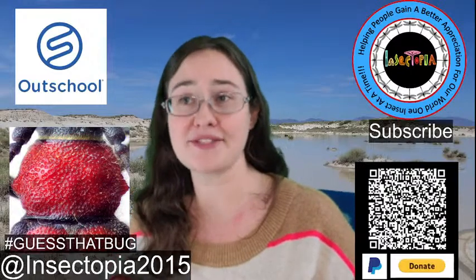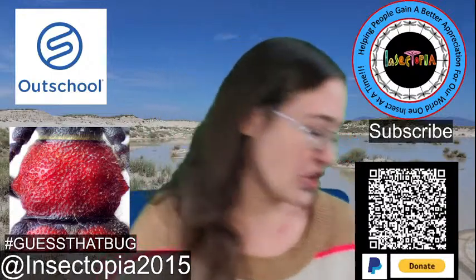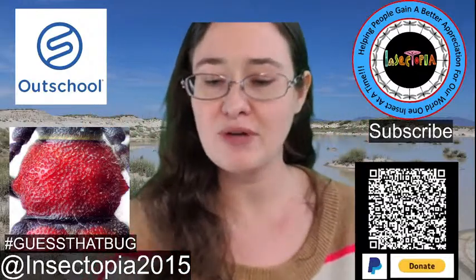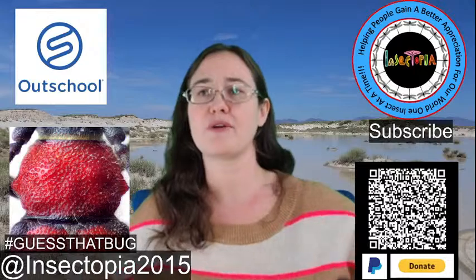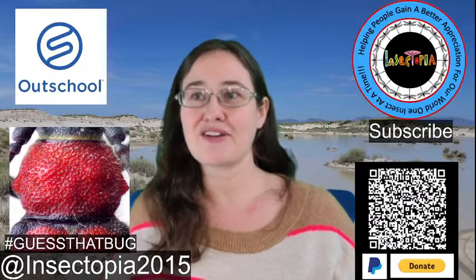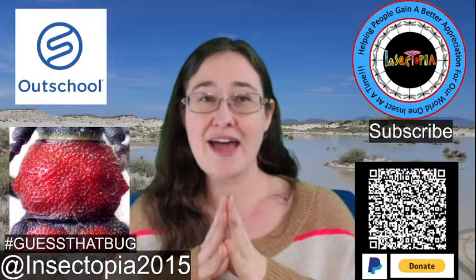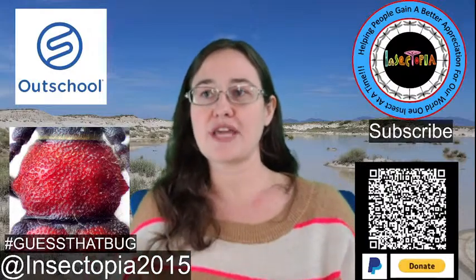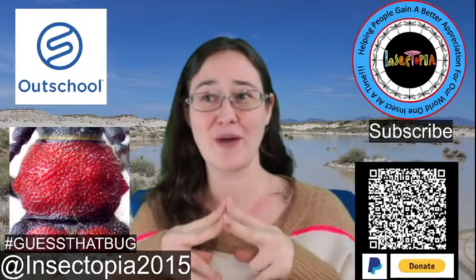Things like moths and butterflies, you can't do this too, right? Because you end up with scales everywhere and destroyed specimens. So what I end up doing for butterflies and moths, and I don't have a needle with me right now, is I carry around a small hypodermic needle, essentially, and I will inject them with just a little bit of alcohol right at the base of their legs so that they can't flap around. And that is a nice way to do it, and it's also fairly quick.